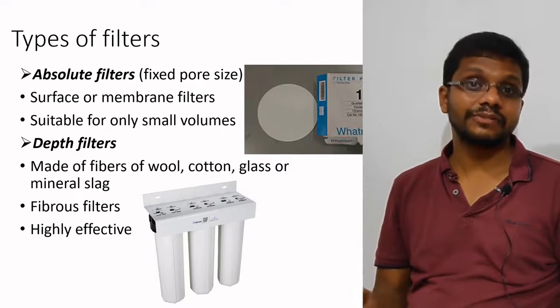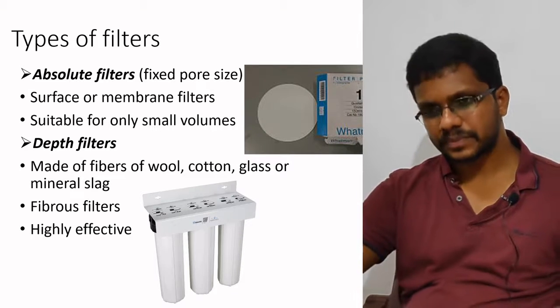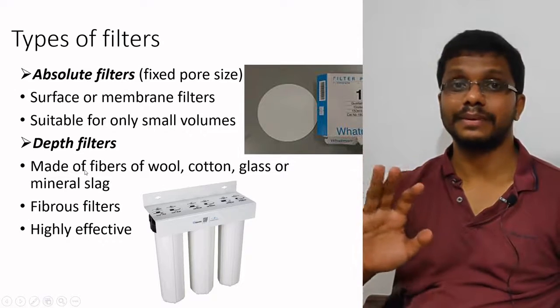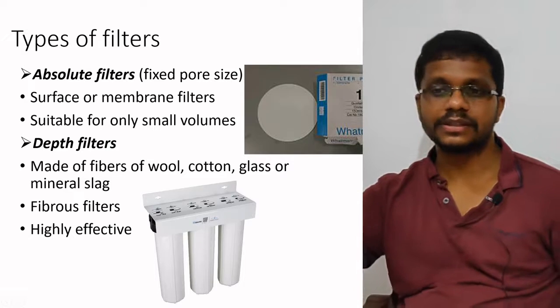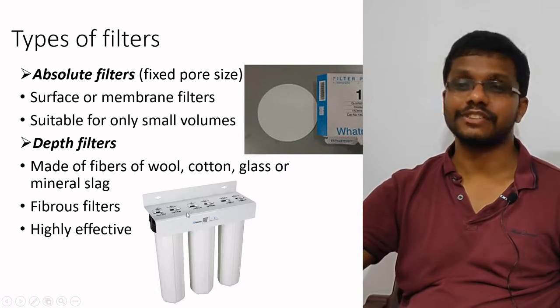Because of the depth filtration, we have clean water in our wells. So the same principle is applied here. Unlike the absolute filters, we cannot say depth filters are 100% efficient. It has an error rate. If you are using these water filters for a long time, they may lose their efficiency.